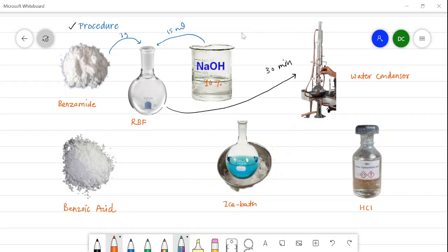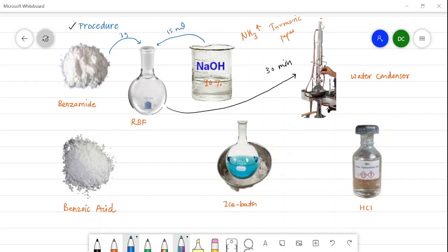As seen in the chemical reaction, there is evolution of ammonia. When benzamide is heated with NaOH, ammonia is evolved and this is tested using a moist turmeric paper placed on top of the water condenser. When ammonia is evolved, the color of the turmeric paper changes to brown, indicating that ammonia is being released.